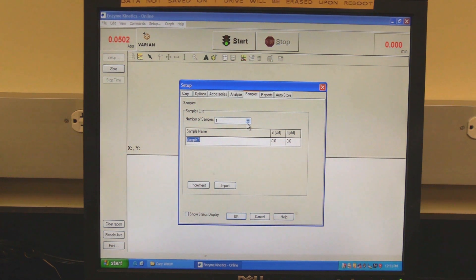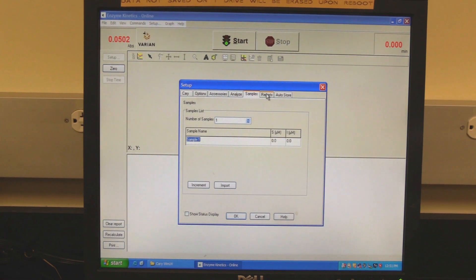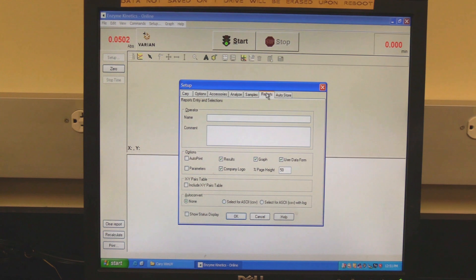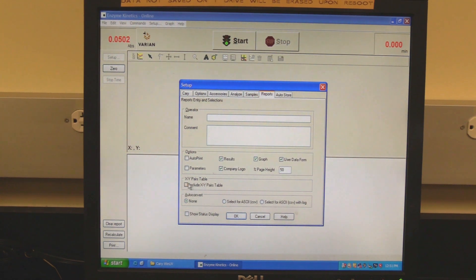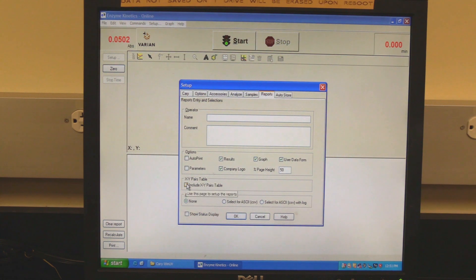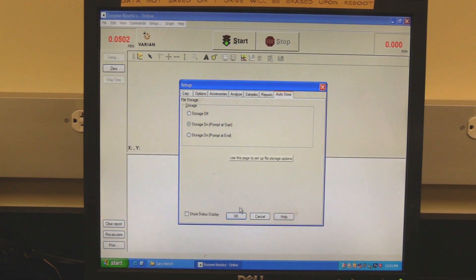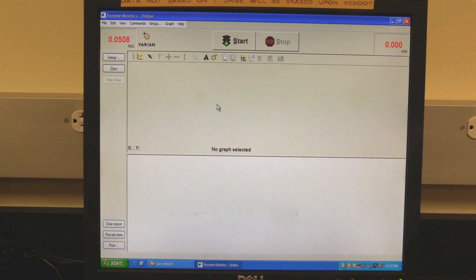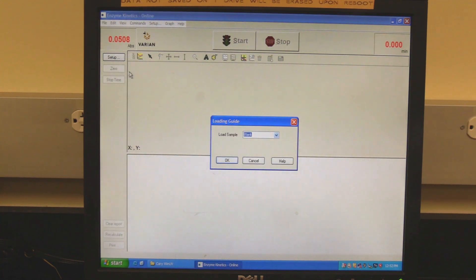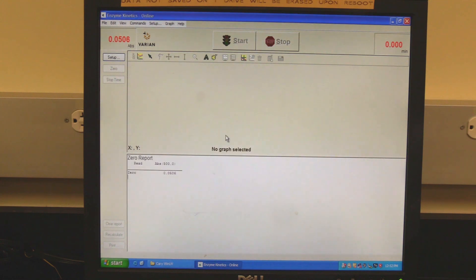Then input the component concentrations for each sample. Click on the Reports tab. In XY pairs, check the Include XY Pairs table box to include a table of XY values in the report. Click on the Auto-Store tab. Select when the software should prompt for the data to be saved. Click OK to set the setup parameters. Click on the Zero button. When prompted, click on OK. In some cases, the instrument may need to be zeroed twice.